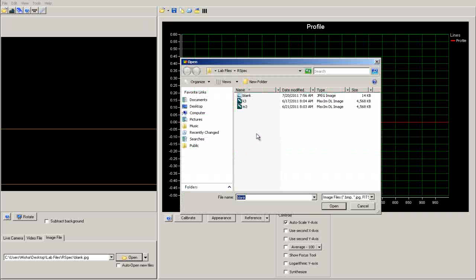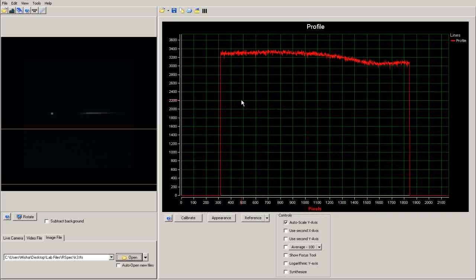Find the file you want to load and double click it to import it into RSpec. This will load the entire image so you will want to know ahead of time where in your image the object is located.